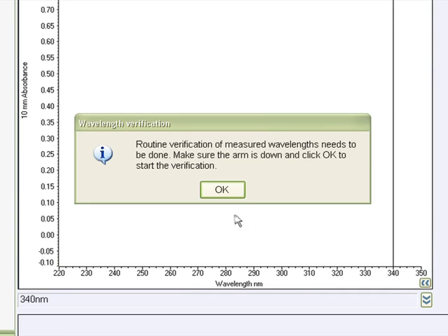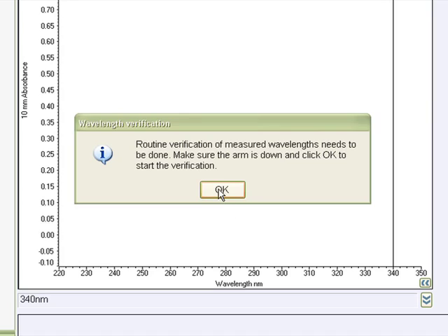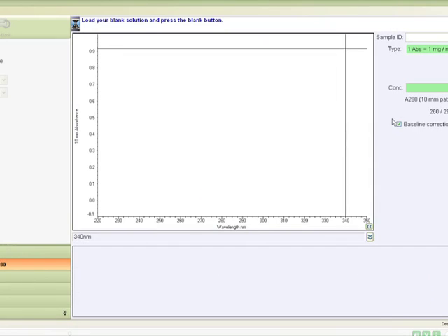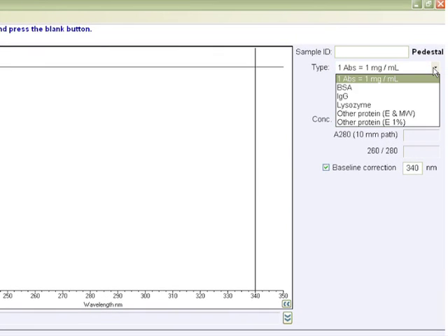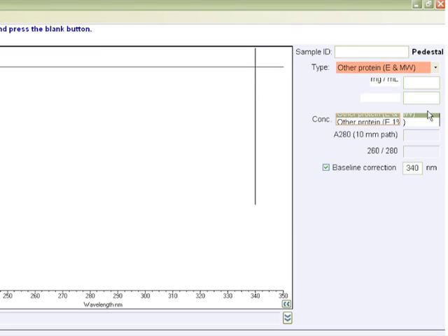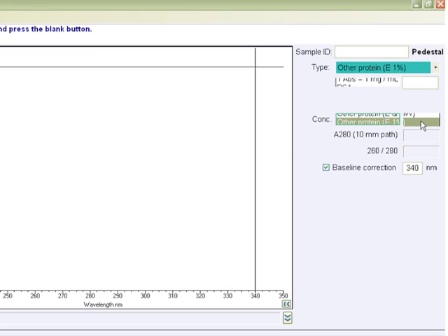To begin this procedure, select the protein A280 application from the main menu. If the wavelength verification window appears, ensure the arm is down. Select the type of sample to be measured from the drop-down list. The default setting is recommended for most unknown protein mixtures in which one absorbance equals one milligram per milliliter. If measuring a previously characterized purified protein, then either the mass extinction coefficient or molar extinction coefficient may be entered to determine the protein concentration more precisely.